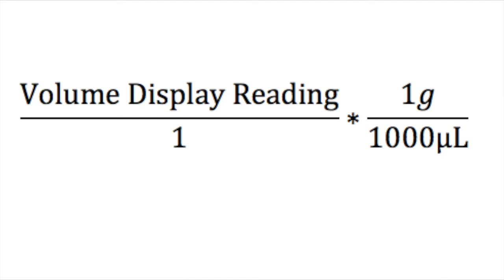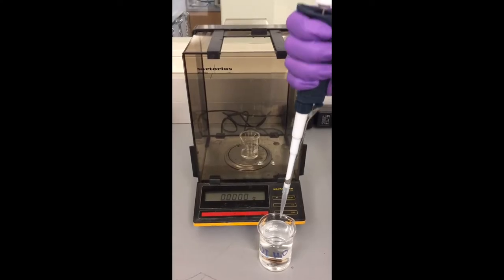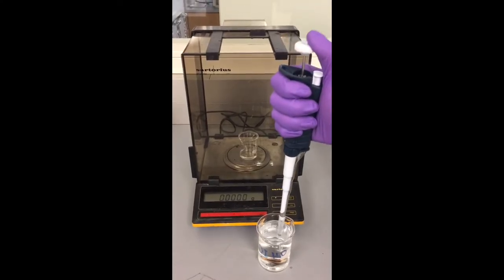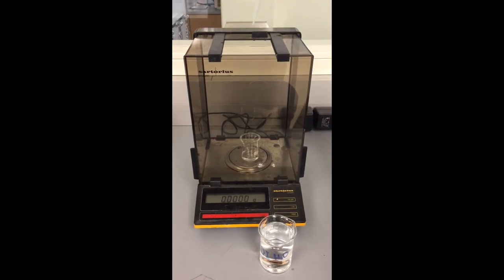Set your micropipet to the highest volume and calculate the expected weight of water for that volume. Your actual weight will need to be within 5% of this number. To calibrate your micropipet, draw up some of the deionized water and add it to the empty beaker on the analytical balance.